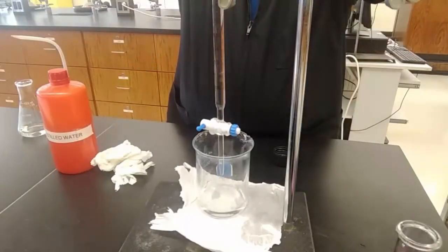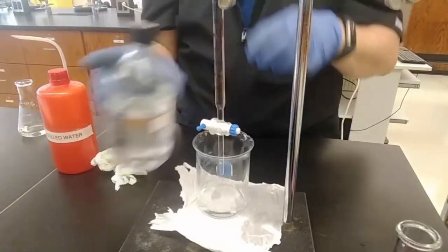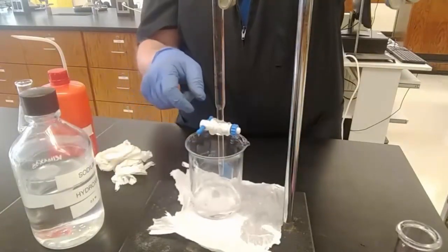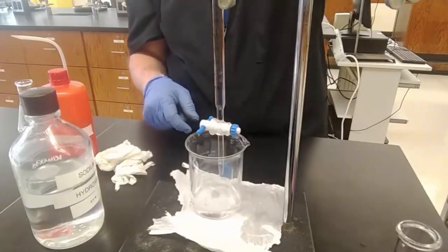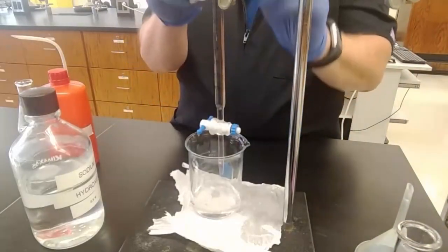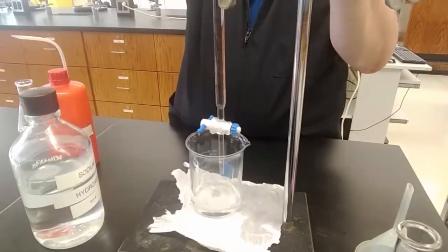And fill her up. Whoop! I actually did overshoot that time. There's still some left in the funnel, so I'm going to turn it on, let it drain out. And there we go. Make sure there's nothing on the outside of my burette that's going to drip into my experiment.